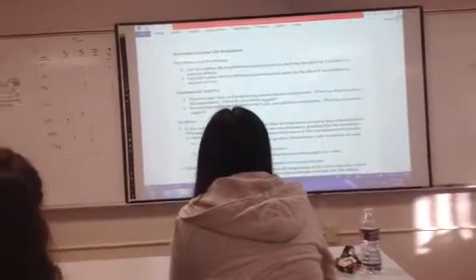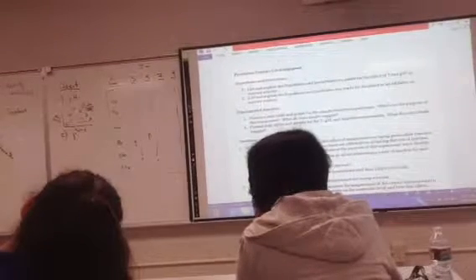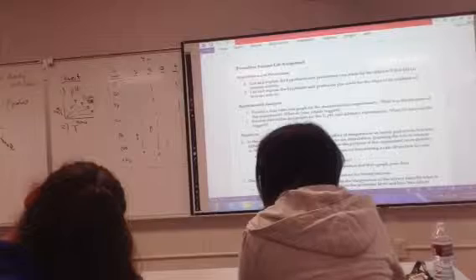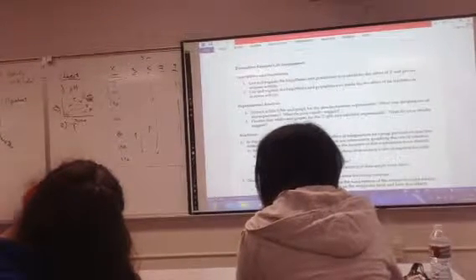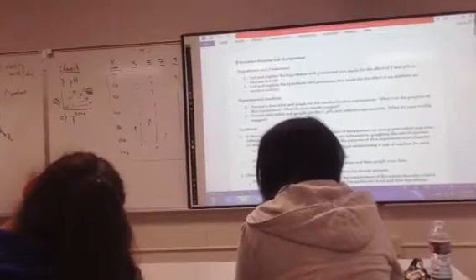And then the interpretation of these graphs has to do with trying to explain why the graph looks the way it does. You should use language and talk about things like denaturation, pHs of cell cytoplasm, temperature changing kinetic energy, and things like that. Right? Those are the interpretations, the explanation of what we'll get there.